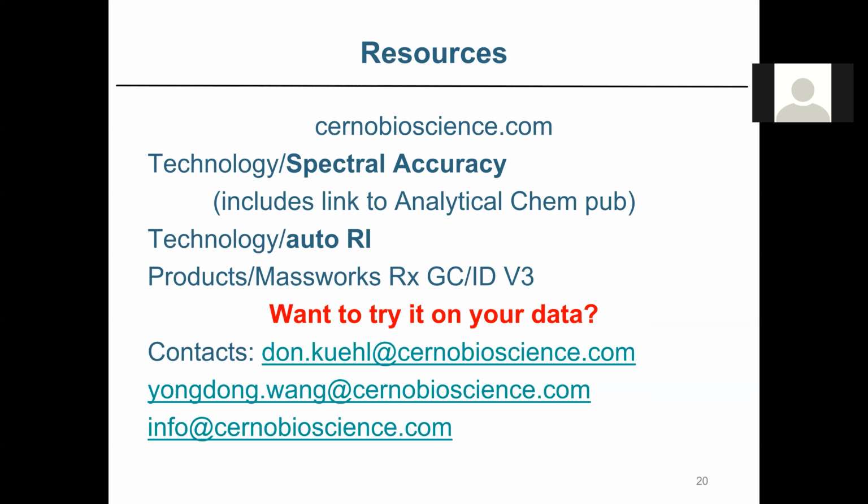Well, first of all, I didn't show this, but we talked about a two-step deconvolution process. We run a PCA, and then, for example, let's say the PCA says there are 3 compounds in that peak. It then tries to deconvolve and pull out the spectra. It doesn't always work. It's just the nature of the math and the noise and the signal to noise. If it cannot pull out the 3rd compound, it'll tell you that it found 3 compounds, but it could only find 2 spectra.